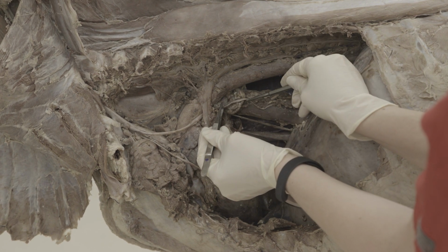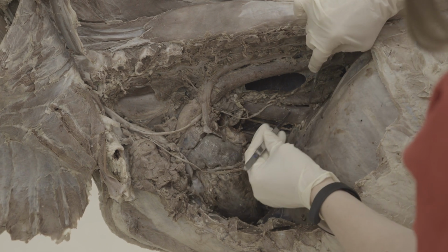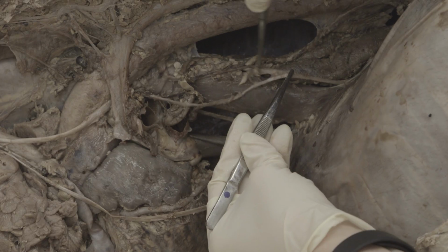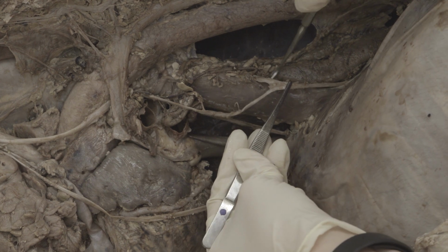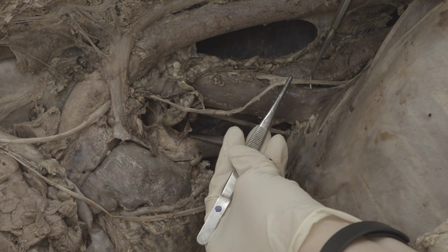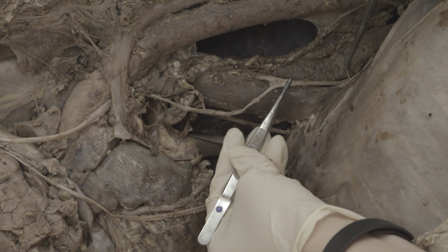Then we have the dorsal branch from the left right here. That will come together further distally with your right dorsal branch as well. So here in the calf, you have a lot of fat to work around, just to give you fair warning. Here you have the dorsal branch from the right side, the dorsal branch from the left side, and that will continue after that point as the dorsal vagal trunk right here.